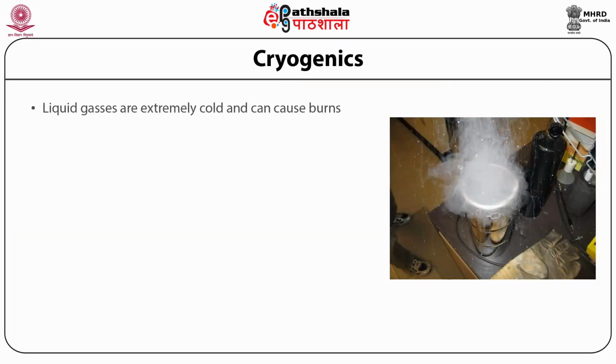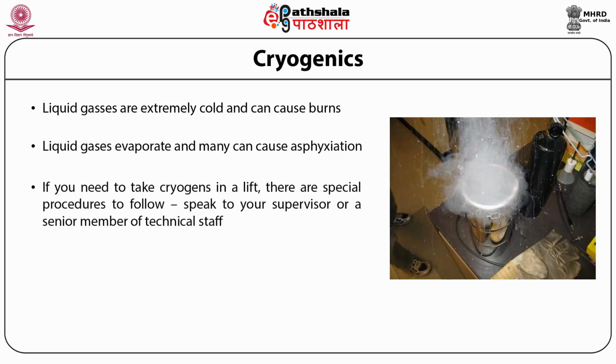Cryogenics. The liquid gases are extremely cold and can cause burns. Also, these liquid gases evaporate and may cause asphyxiation. If you need to take cryogens in a lift, there are special procedures to follow. Speak to a supervisor or a senior member of technical staff. And you must have special training to use them in a safe manner.